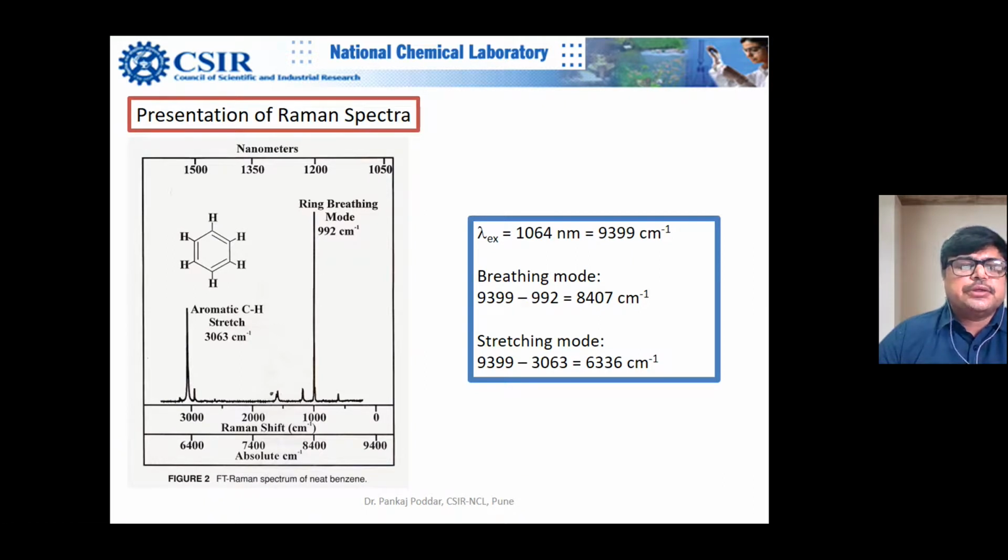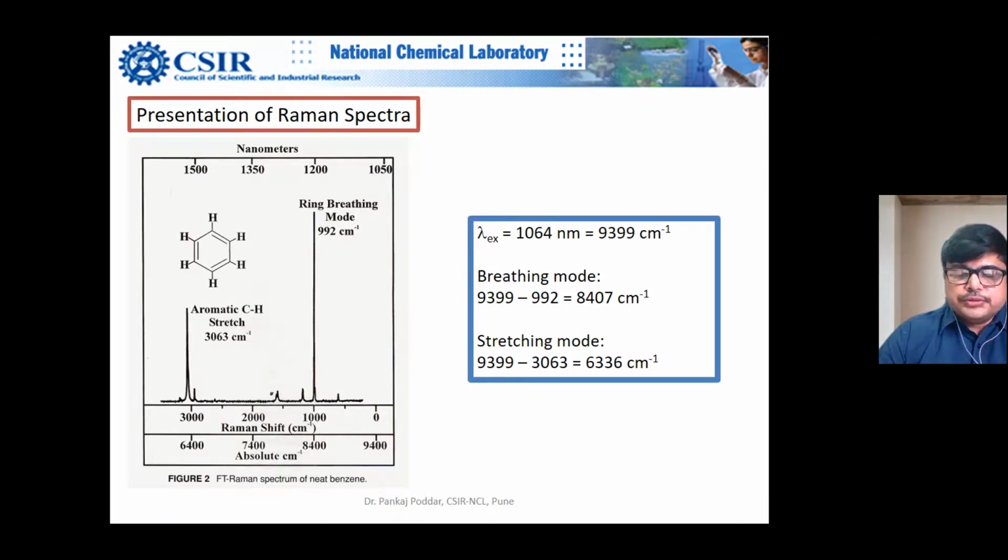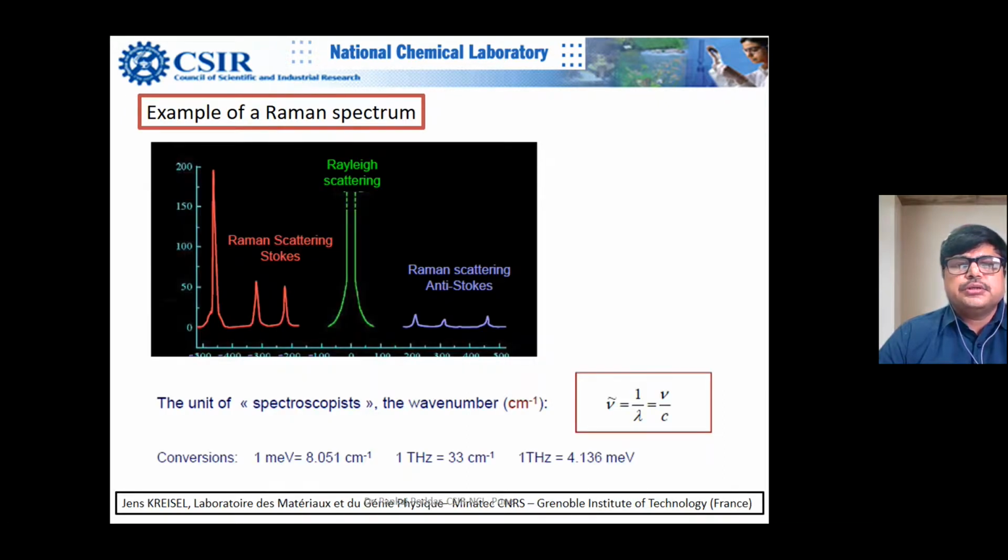Then you can assign all these peaks, and it is also possible to theoretically calculate them using popular simulations like DFT. You can find all these Raman bands, and for a simpler system you can easily do that. In solids, we talk about phonon bands, the E-k diagram of the phonon dispersion law, and all these acoustic modes and optical modes, longitudinal and transverse modes. I'll not speak about it, but that's how we usually do it as physicists. Probably you are already aware of the dispersion diagram. For acoustic modes, at k equal to 0, E is equal to 0, but it is not the same for the optical modes. For optical modes, at k equal to 0, E is non-zero.